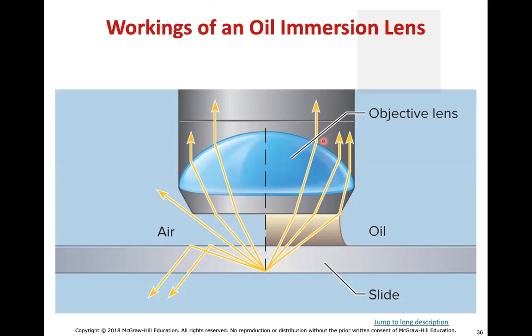Okay. You only need to use oil with anything above 100x, and that is if the lens is actually an oil immersion lens. They do now have microscopes that do not require any oil.